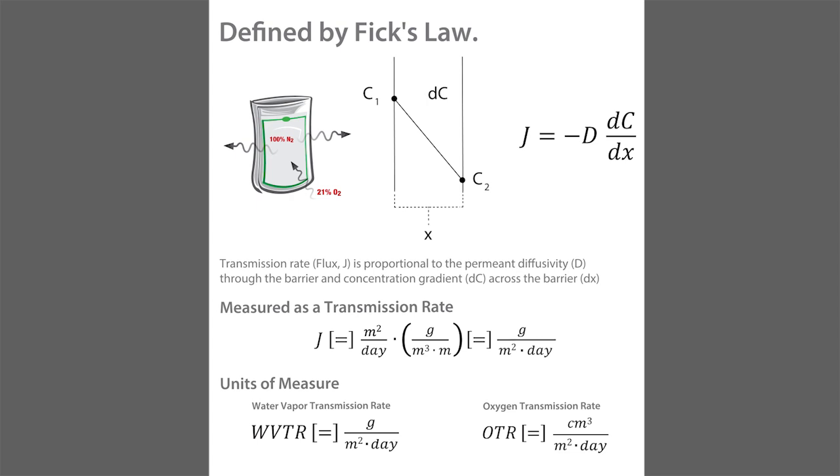It kind of makes sense. If you're talking about water vapor, if you've got a moderate humidity that's challenging the material, like 50% RH versus 100% RH, the 100% RH is going to let more water vapor permeate through the sample.